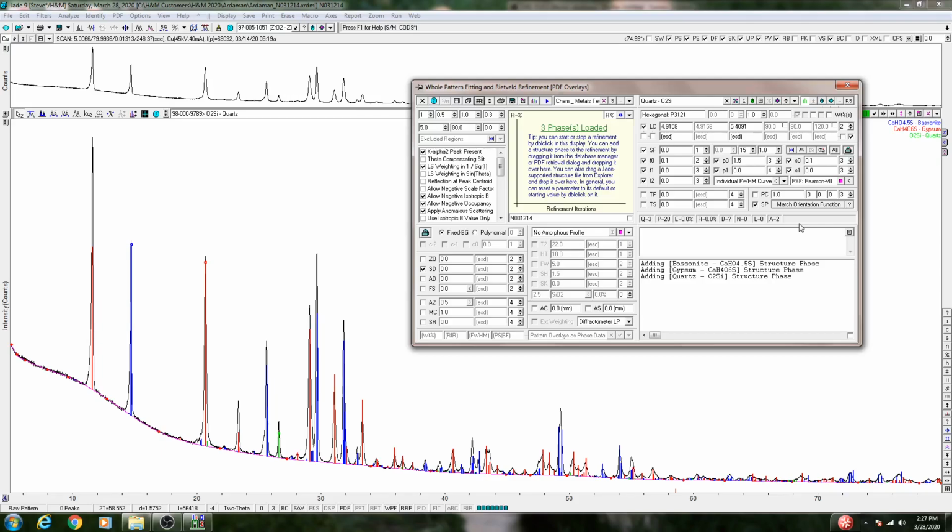And in fact, there are even more underneath some of these things. If I were to press this, you'll see that there's actually a P2 value and S2 value, which are buried underneath this tab. There are multiple preferred orientation functions. There's various switches through here. And like I said, for the most part, I'm not going to go through most of these. I'm just going to go through a simple demonstration of a Rietveld refinement, because we can, for the most part, rely on the default settings.